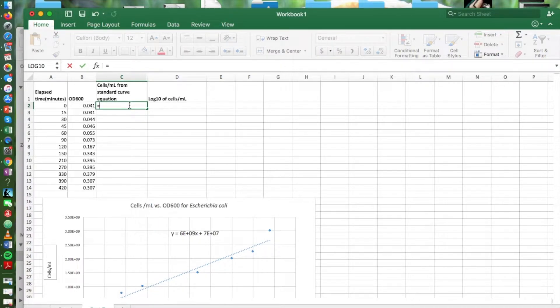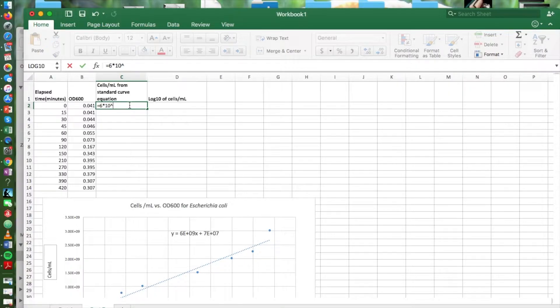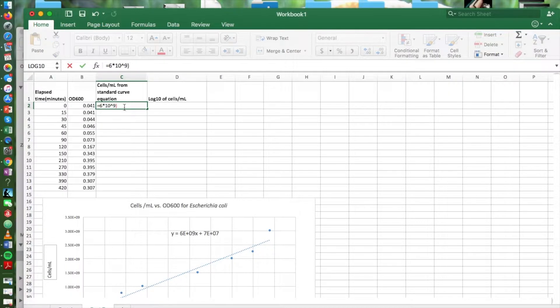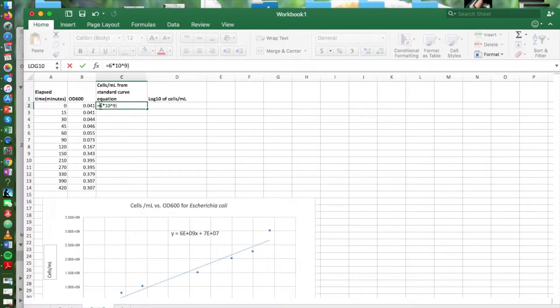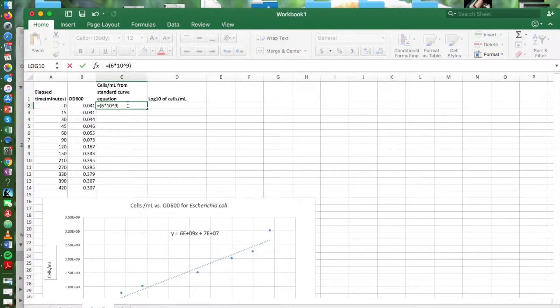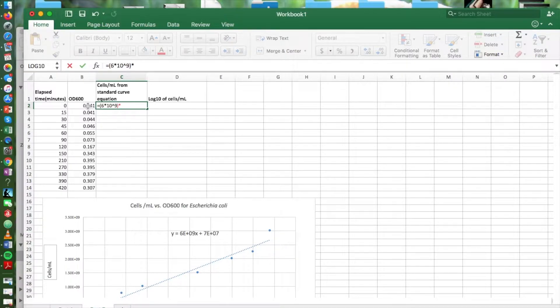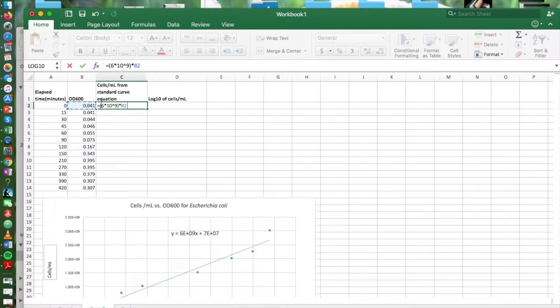So let's put in our formula. It's going to allow us to convert our X, the OD reading, into a Y calculated cells per ml. We're going to use that equation that we developed from our standard curve.